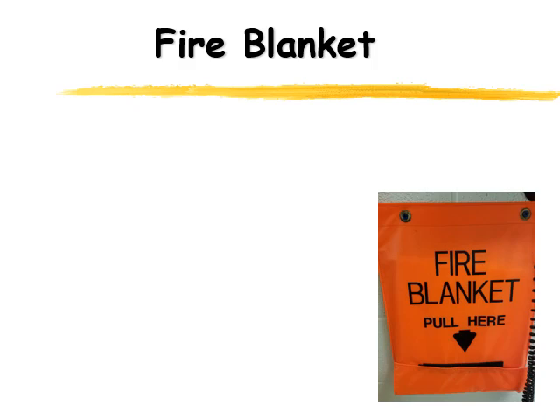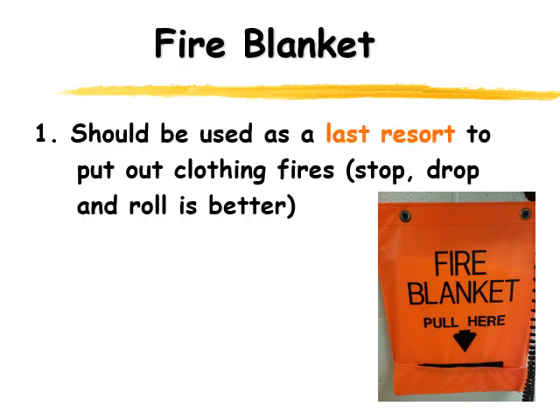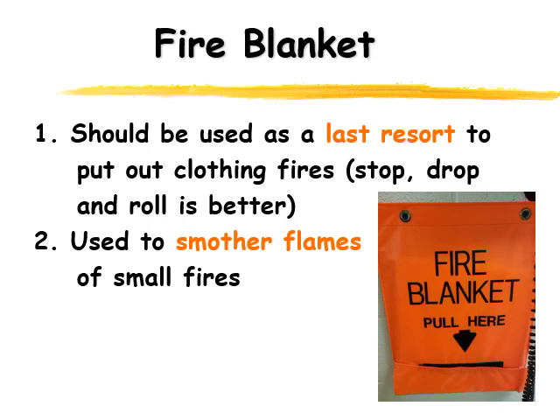If somebody goes on fire, the best thing to do is have them stop, drop, and roll. But if you need to use a fire blanket to tamp down the flames, that would be really useful. Basically, the fire blanket is used to smother small fires. Once you've used the fire blanket, you need to get a brand new one — they're one use only.